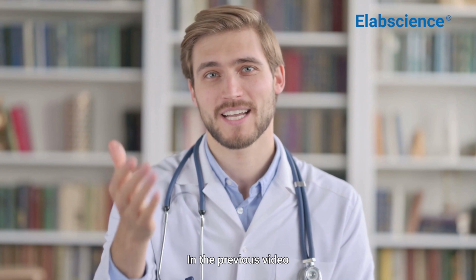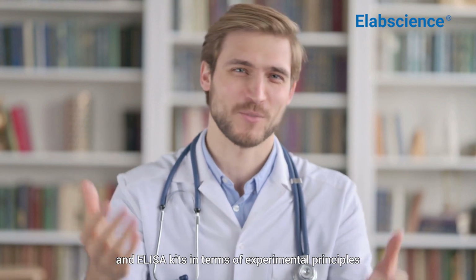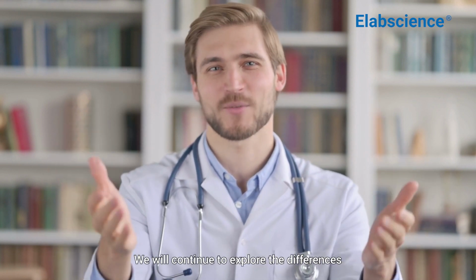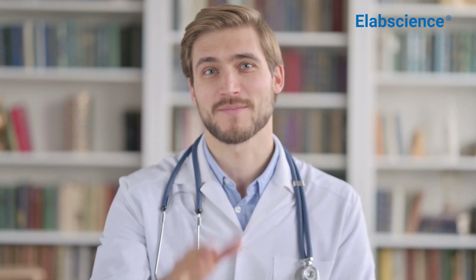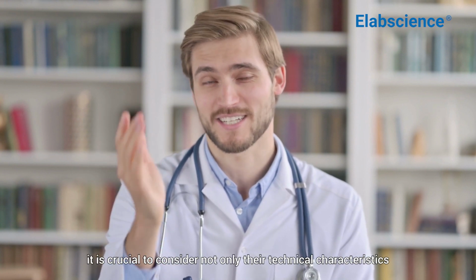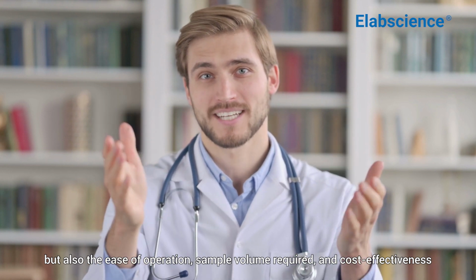In the previous video, we learned about the differences between Multiplex Cytokine Detection Kits and ELISA kits in terms of experimental principles, detection throughput, and sensitivity. We will continue to explore the differences between the two methods in terms of experimental procedures, sample consumption, and cost. When choosing the appropriate detection method, it is crucial to consider not only their technical characteristics but also the ease of operation, sample volume required, and cost-effectiveness.